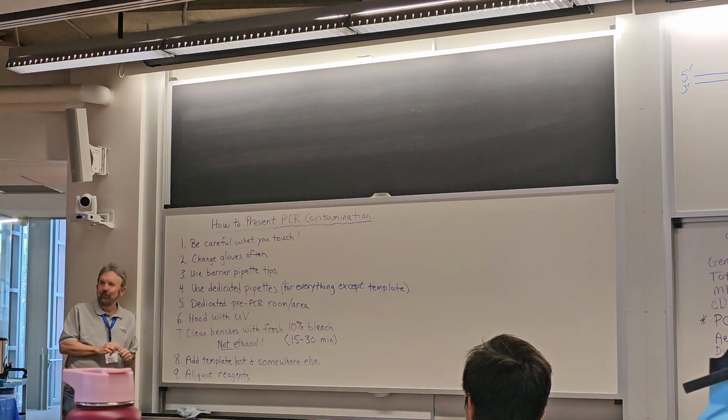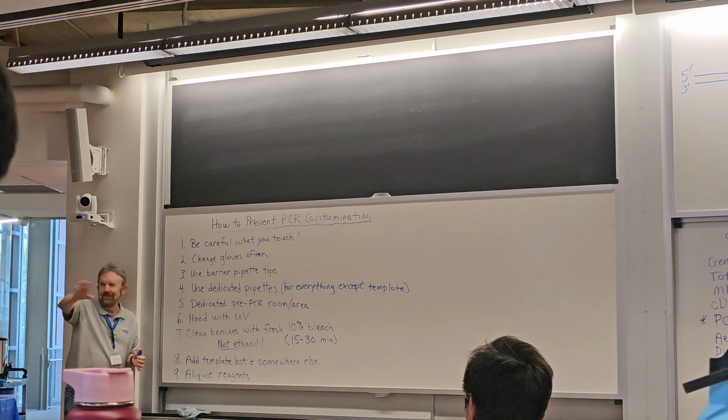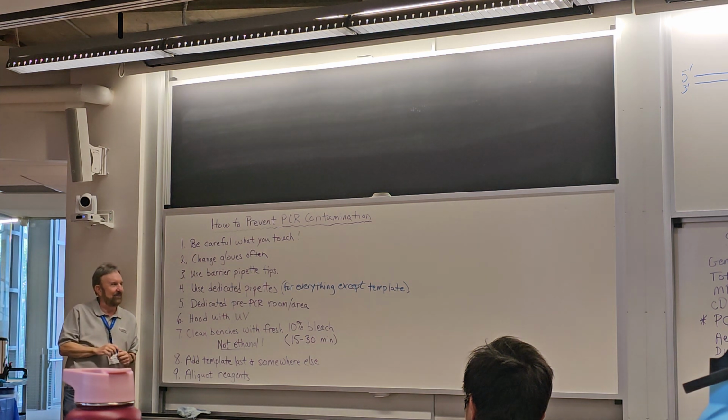Funny story about Ford, our building here, and our pre-PCR area. When this building was designed, I made sure they designed in a pre-PCR area, right? So a nice pre-PCR room, had a separate air supply, and a door, and it was completely separate. It was away from my lab, across the hall and away. So perfect, really perfect for our purposes.